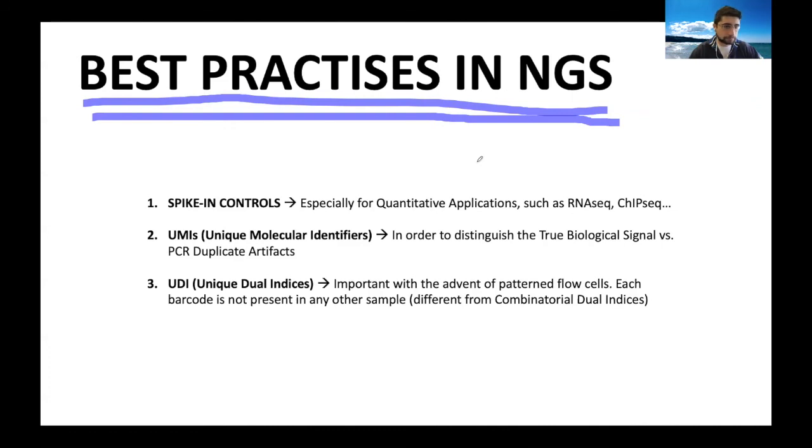Okay. There are 3 topics that I want to talk about. We're going to briefly mention the spike-ins. UMIs, we've seen them already. I just want to stress that out. And then the very important UDI adapters. Okay.